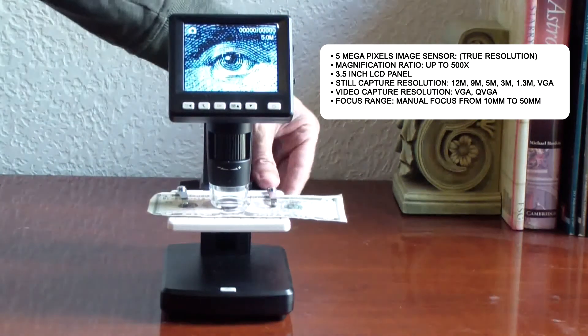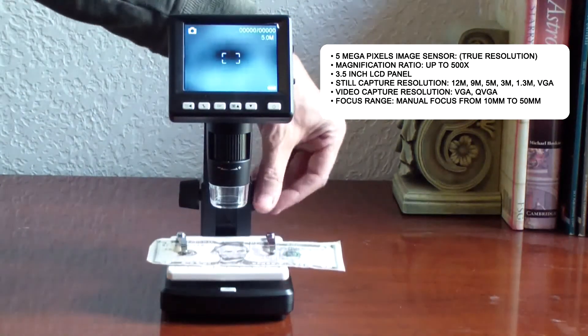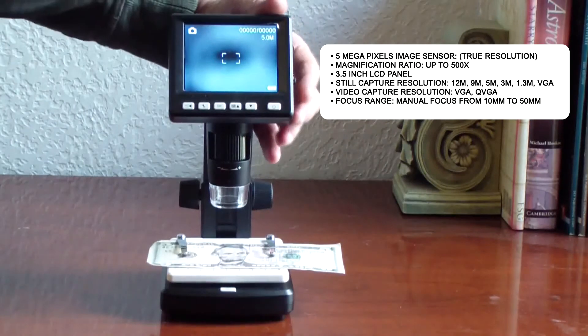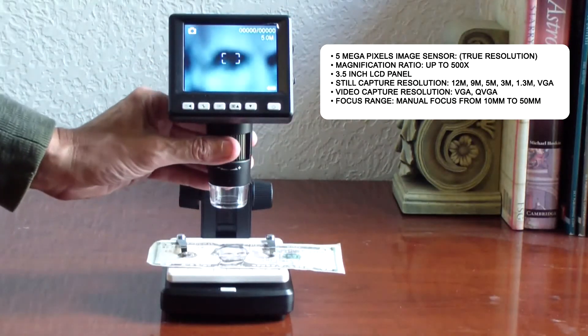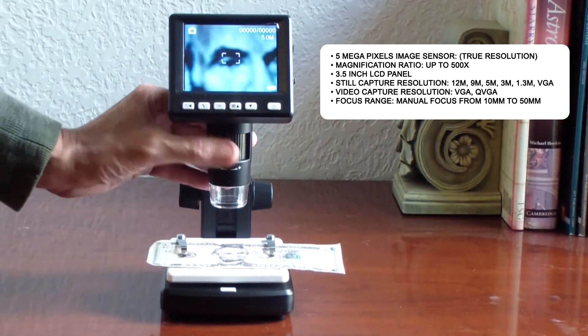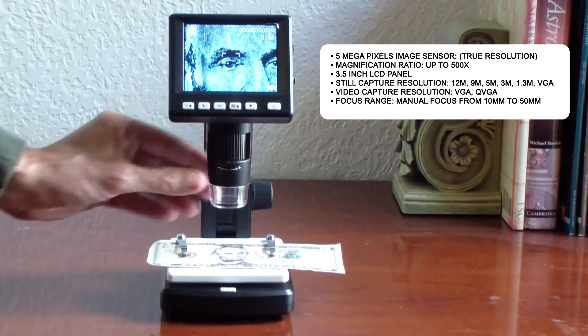Bring an object as close as you need with 125x optical and 4x digital zoom and magnification up to 500x.